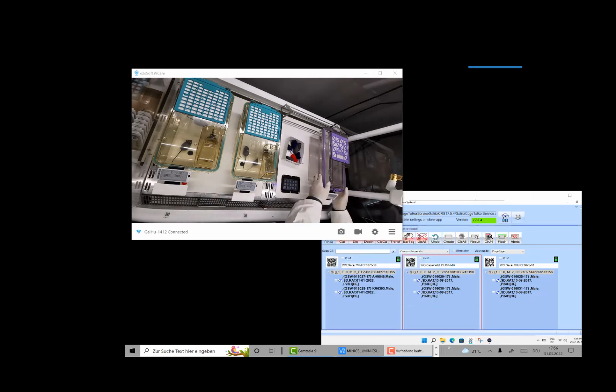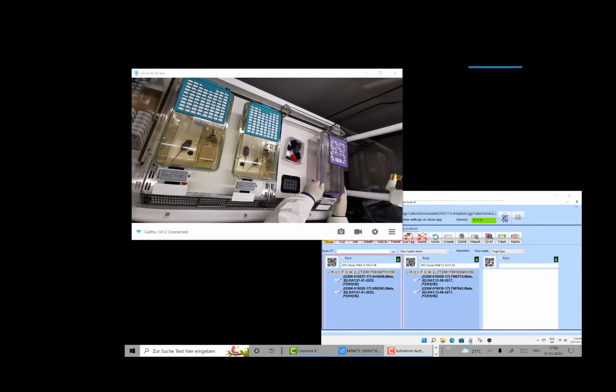and we go. So there are two ways. You could also just wait, and maybe what I did was not so clever to put them all up, because in this way you're automatically focusing on the cage and you've got the focus on that cage. So this is maybe easier then.